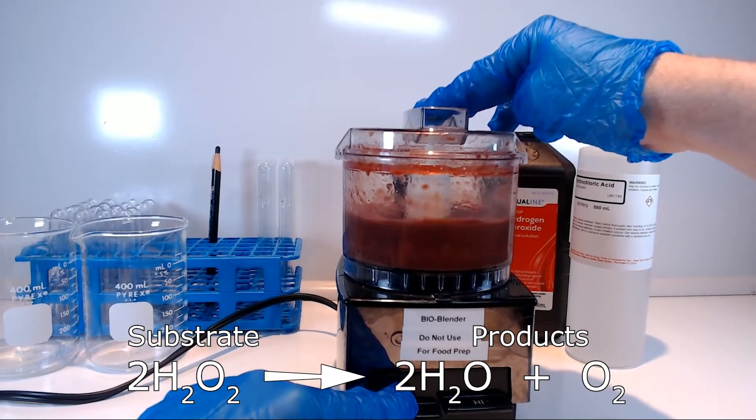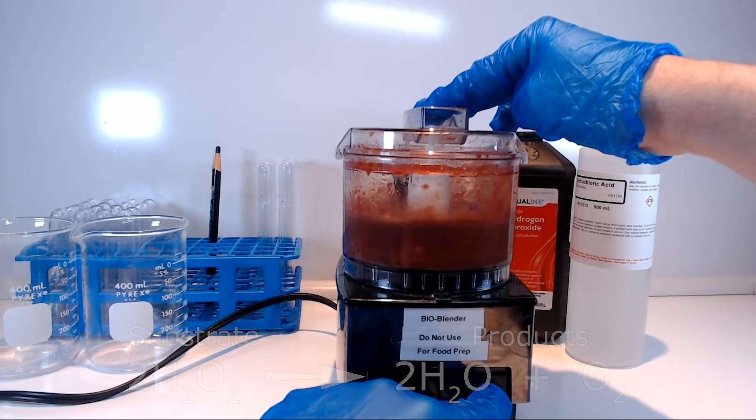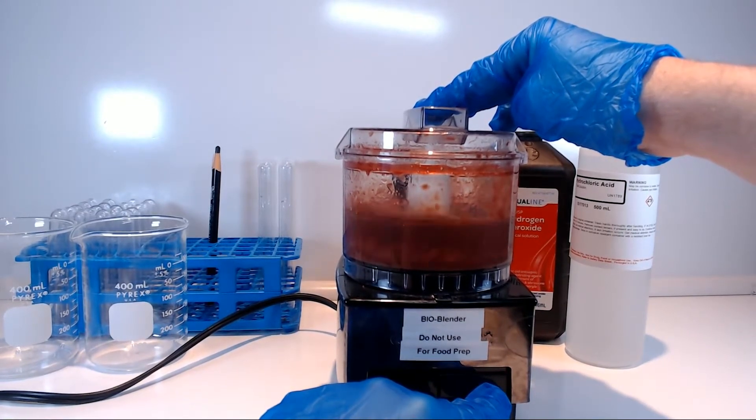More foam, more bubbles, more gas, more product, more activity of catalase.